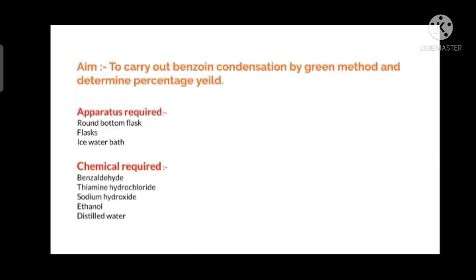First of all, our aim is to carry out benzoin condensation by green method and determine percentage yield. Here are the apparatus required for the experiment: round bottom flask, normal flask, and ice water bath.